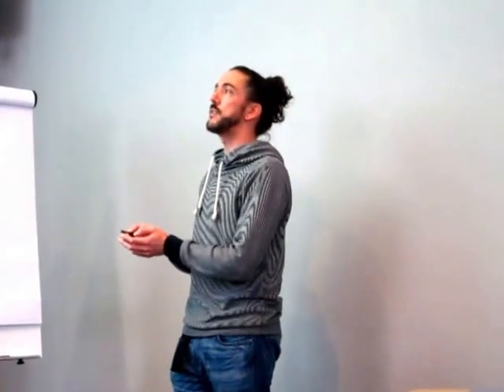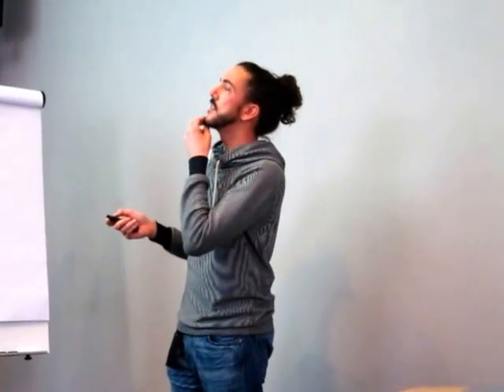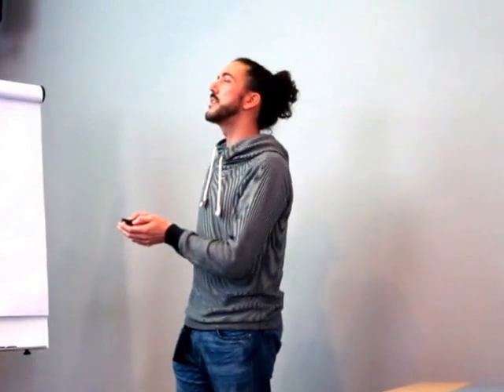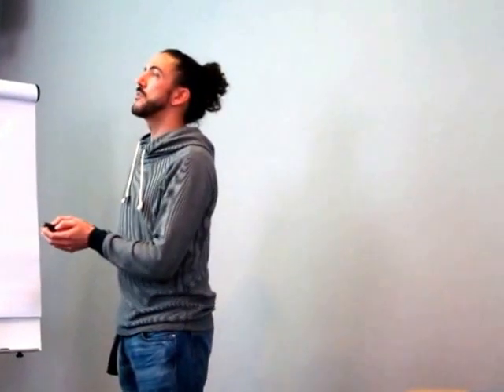Okay, we can cluster solutions if they are very close, depending on the... sorry, I can't remember this option either now. I'm sorry. Okay, and this is the number of solutions that we want to consider.